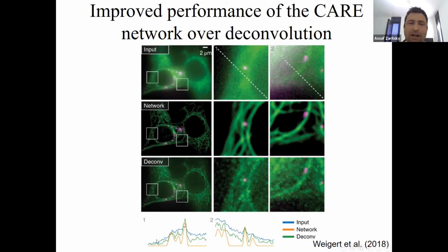While when we look at the reconstructed image, the orange line profile below, you can see these small hills, and each hill is a filament. So you can see the transition from background to non-background over the filaments. So basically the CARE algorithm is much better than the deconvolution, in this system and this setting, etc.